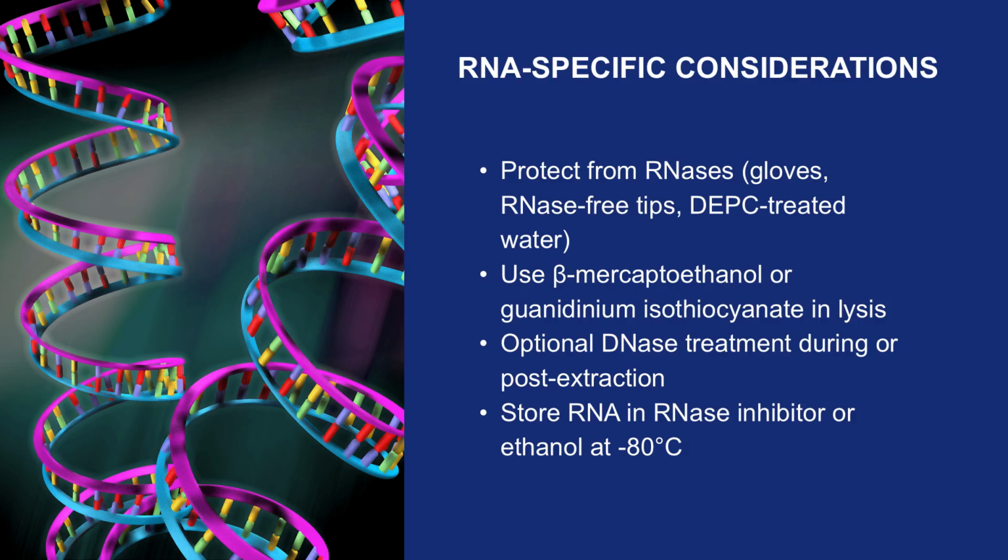For clean RNA, include a DNase treatment step. Finally, store RNA at -80 degrees Celsius in ethanol or an RNase inhibitor solution for long-term stability. Next, let's briefly review tips for handling DNA samples.